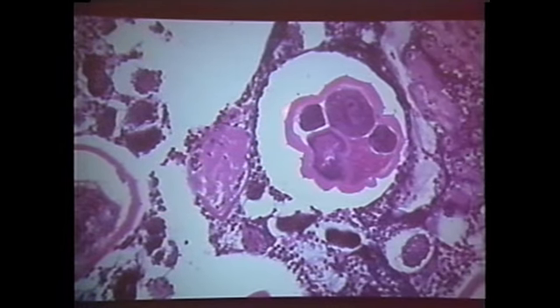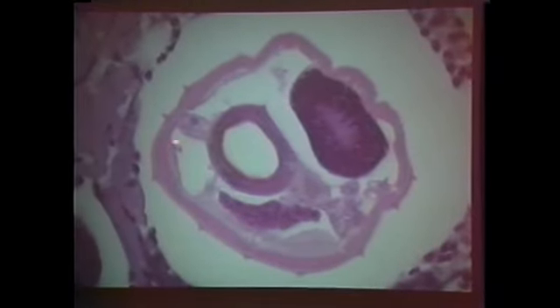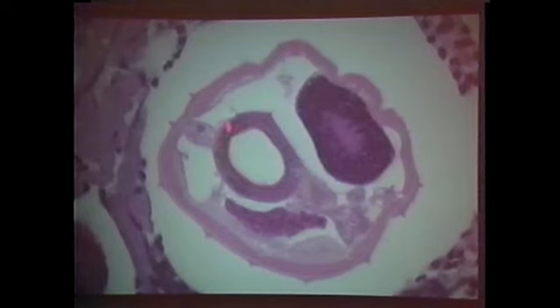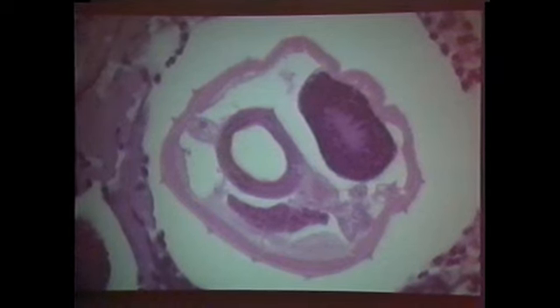Let's look at this one over here. Look, it's platymyarian muscles, and look at those little longitudinal external ridges. These are your trichostrongyles. Here we go again. Look at that platy. This is one muscle cell, platymyarian muscles. Here's the intestine. Here are the little evenly spaced cuticular ridges, and here they are, evenly spaced. And then when you're getting into the lateral area, they kind of flange out.